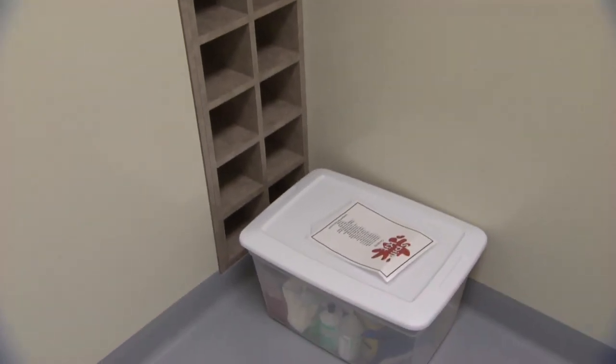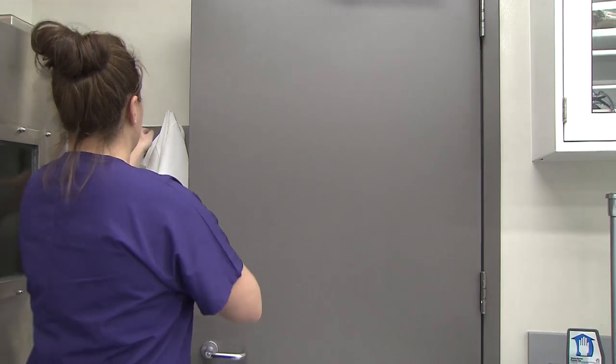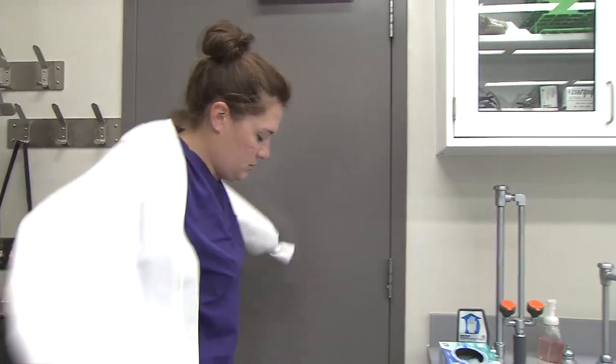When you actually get to your laboratory, you would put on an additional layer of minimum PPE for any laboratory, and that's going to be one pair of gloves just for going into the lab.